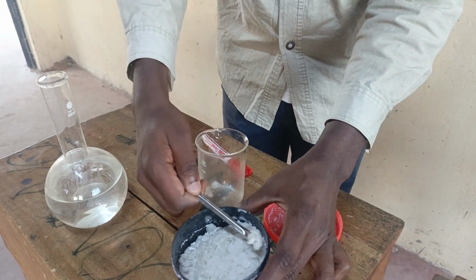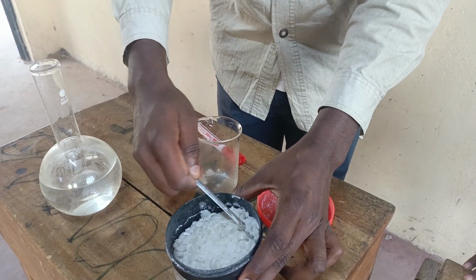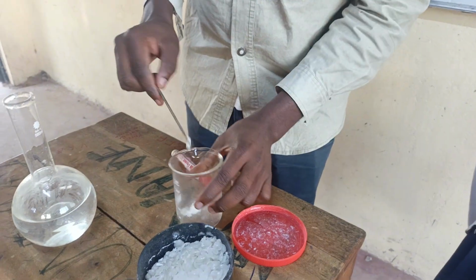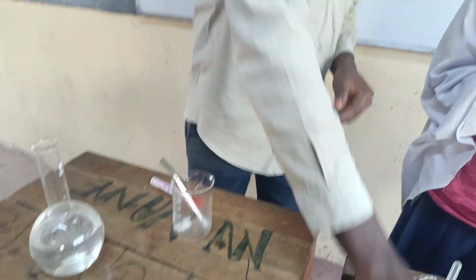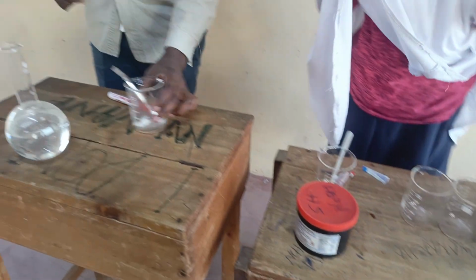How many pellets are enough? We're going to take just 2 like this. And then we stir. We should use a stirring rod. So take water, then dissolve it.